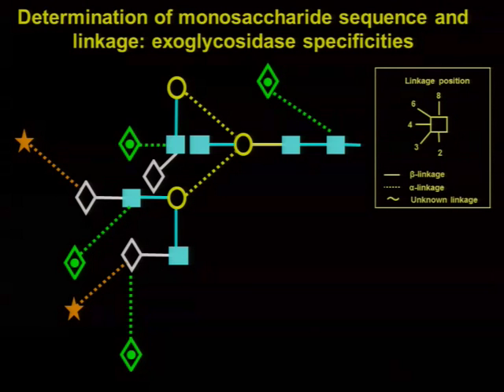But if you use very high concentrations and you keep incubating for ages, they will display other specificities. So it's really important that you go through our papers, because I know our papers, but I'm sure other people's as well, and make sure, or go to New England Biolabs, with whom we've had now a 2-year collaboration cleaning up these enzymes.